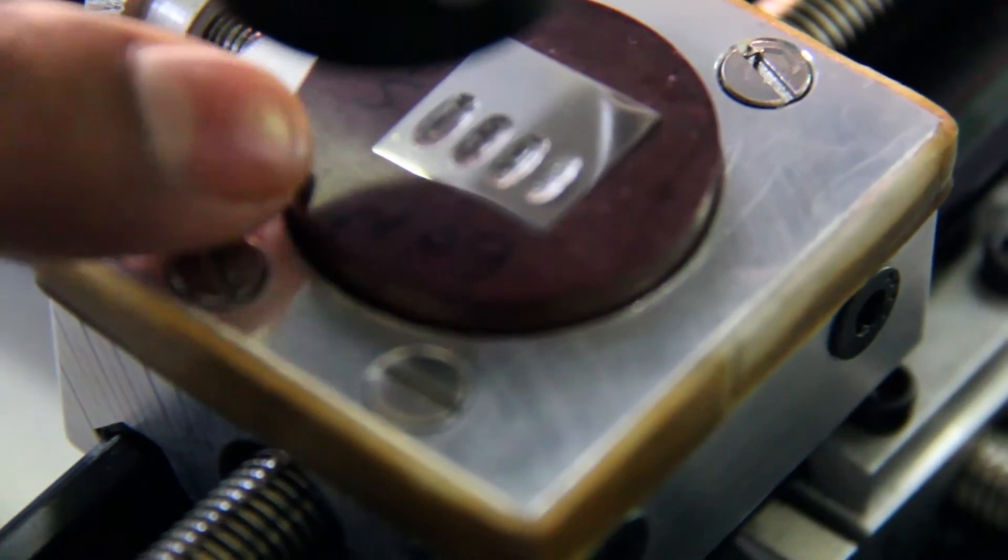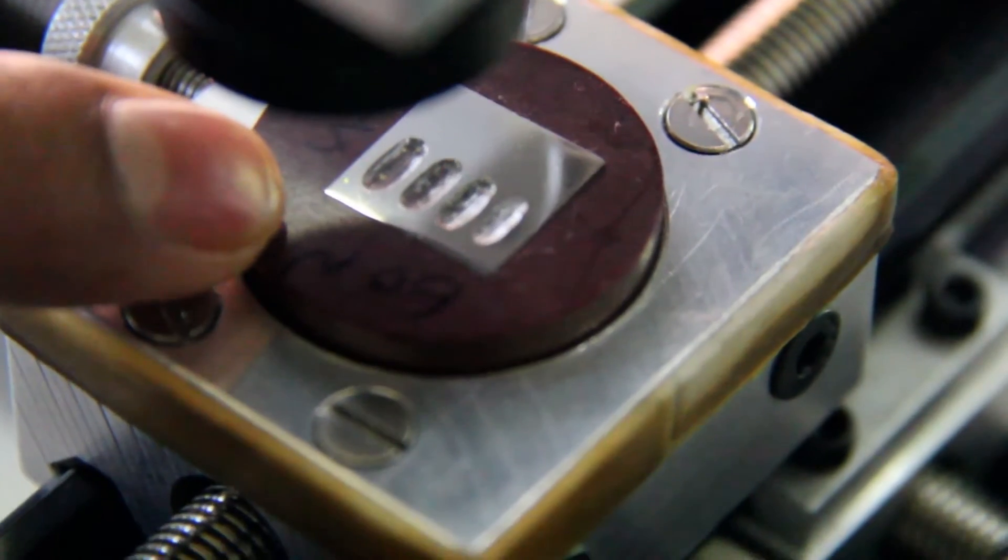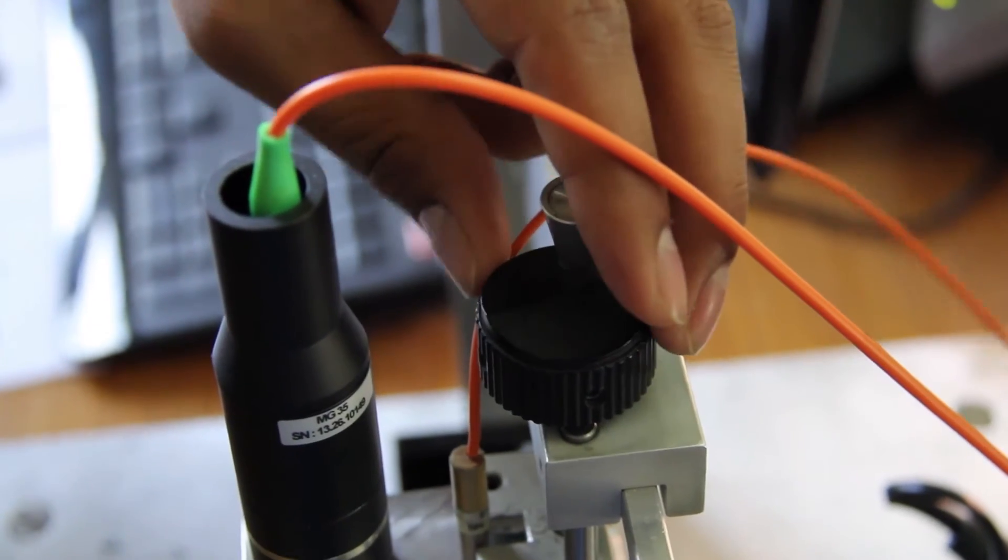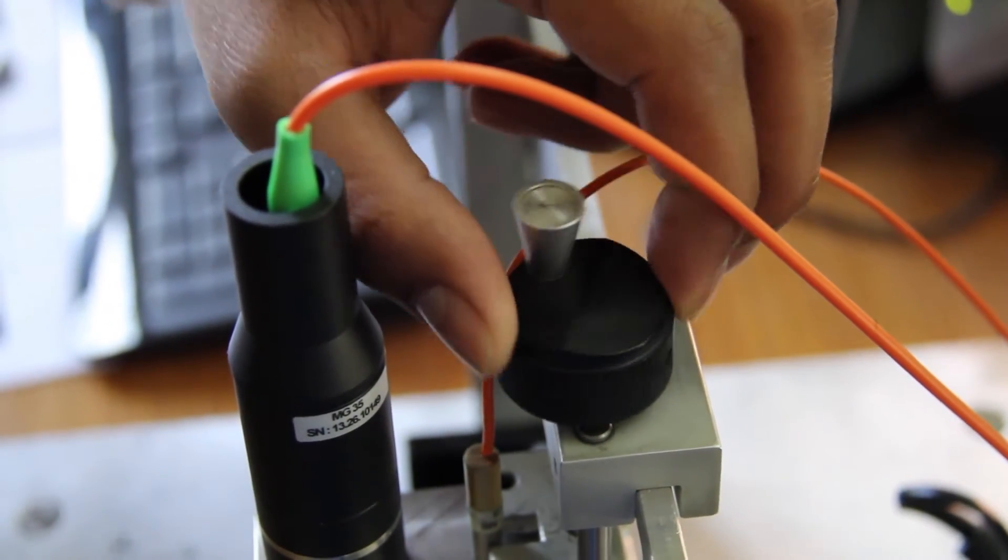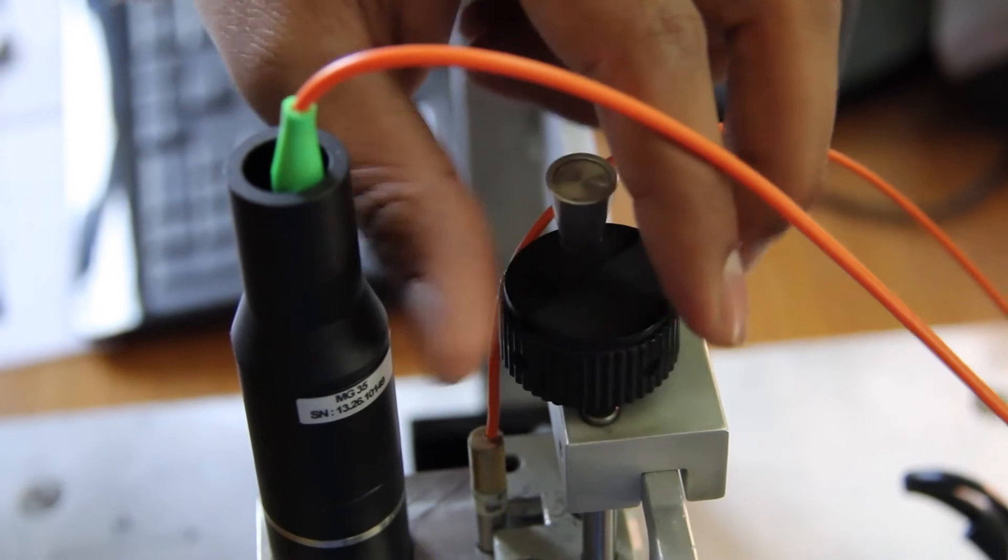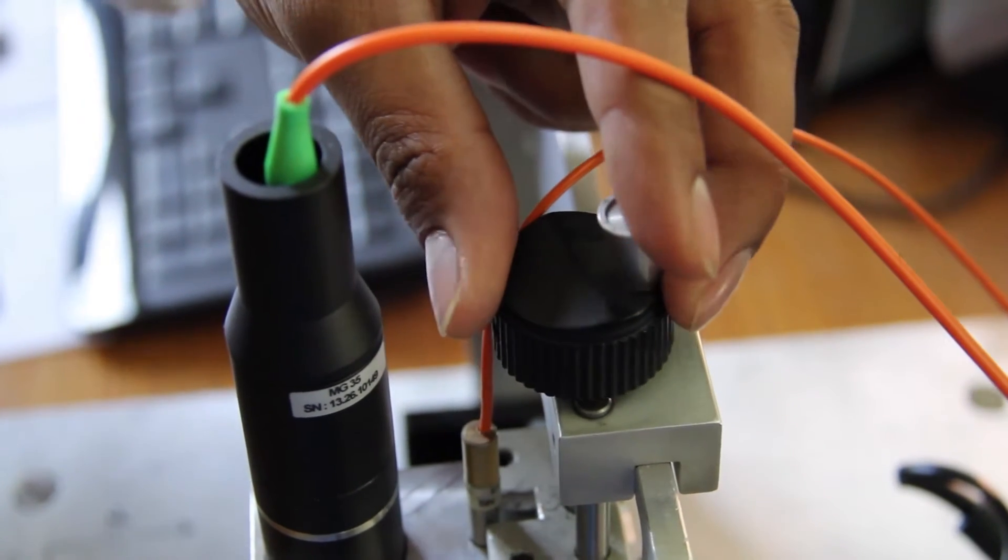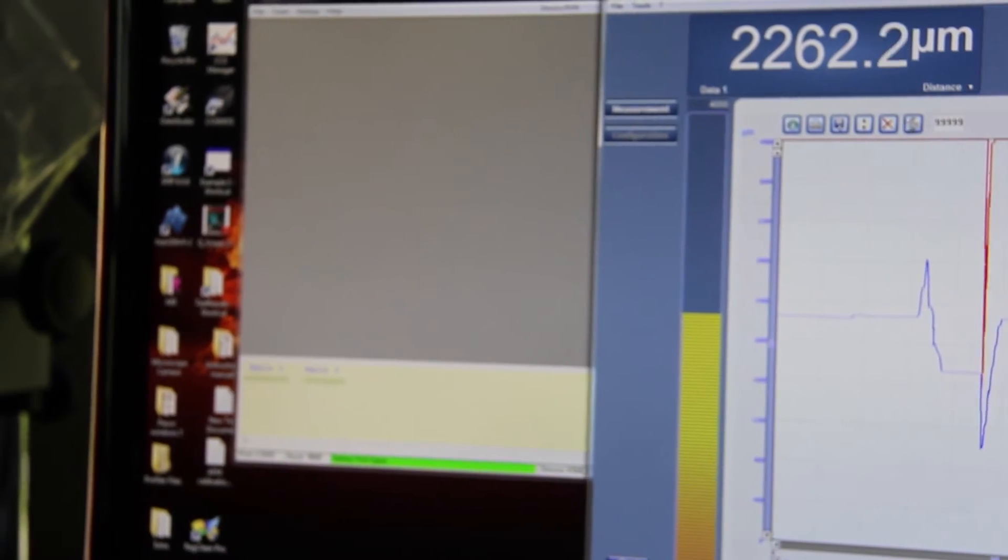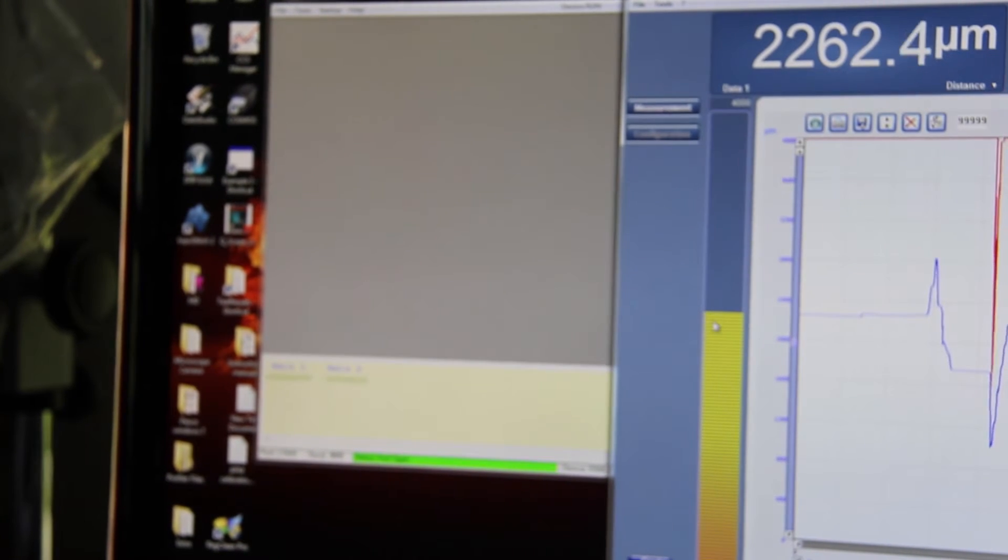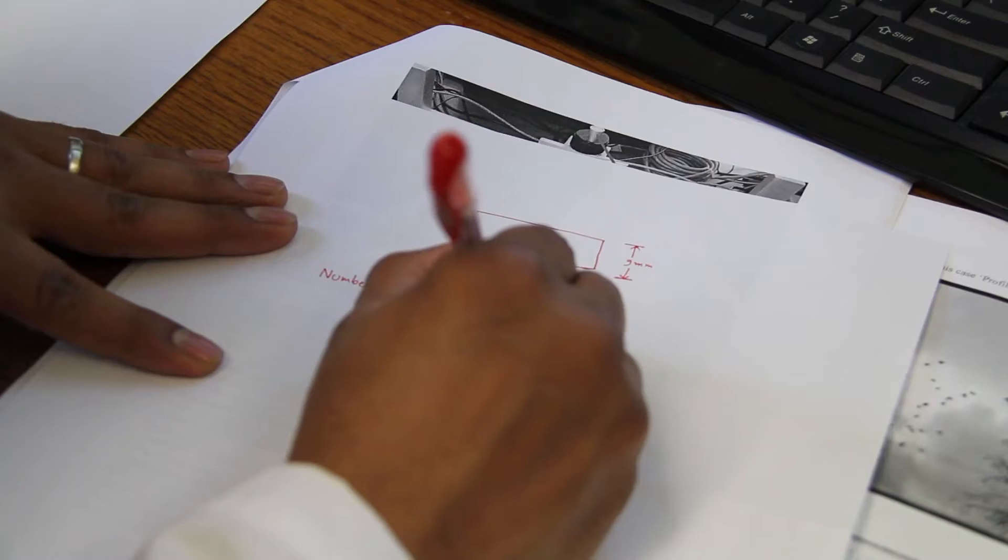Adjust your pen and adjust the focal distance. You can move your optical pen up and down by using this set screw and try to focus the sample. Make sure the distance is at the middle and intensity at the middle.